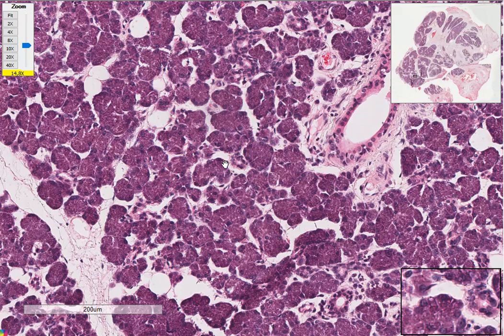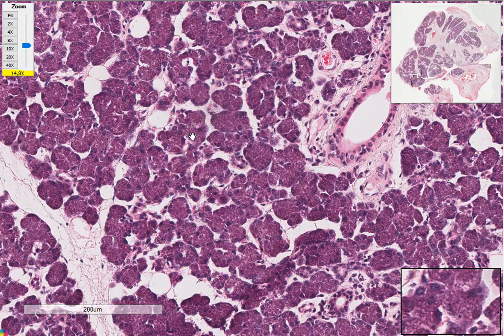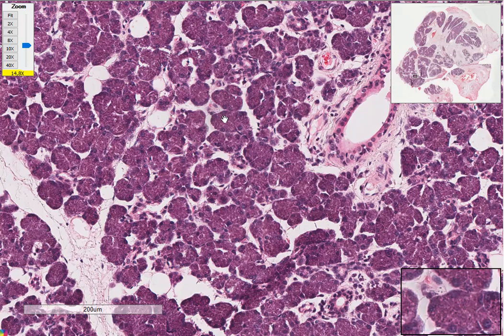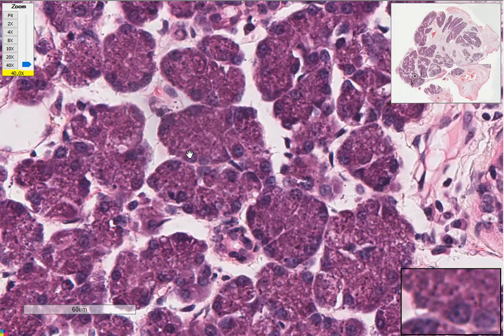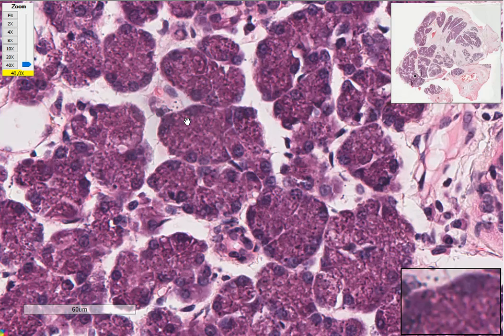And then we notice that these serous acini cells are pyramidal in shape and round, and you can see the nucleus is basally located. Let me just go into higher power. So this is the nucleus, and it's basally located.